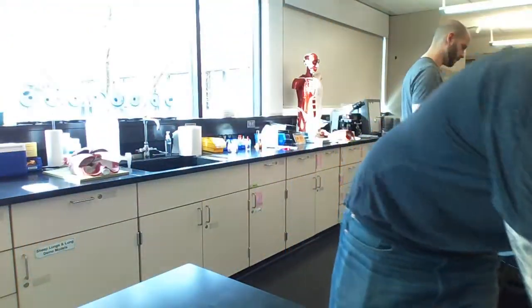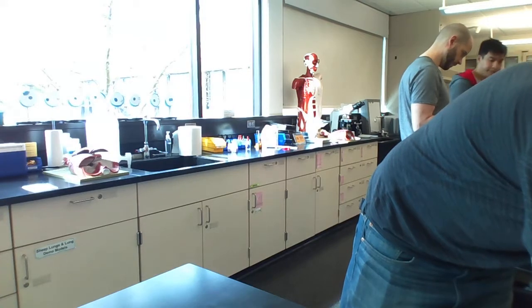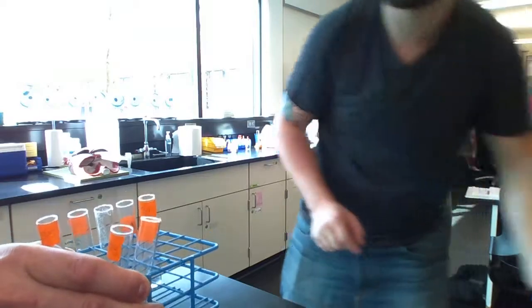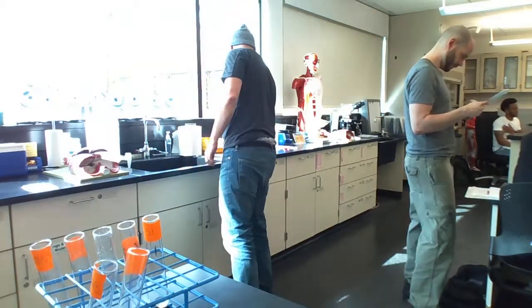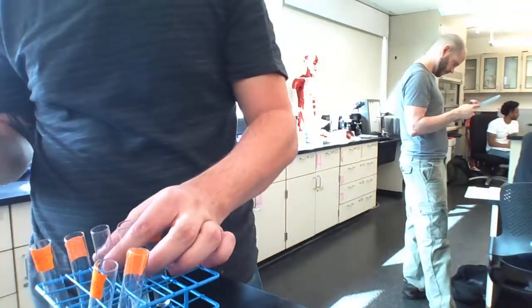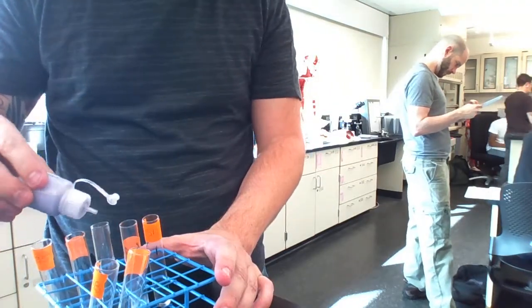Wasn't much in there. Alright, 5 drops of, what are we adding now? Litmus? Yeah, 5 drops of litmus to the non-sticker ones. Like digestive.